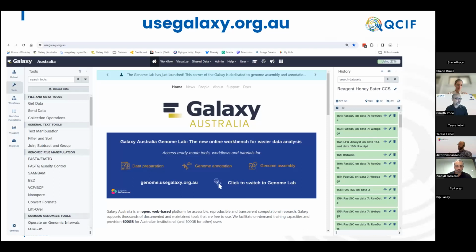Gareth, would you like to give us a bit of an overview about Galaxy? Yes, thanks, Kelly, and thanks, Jeff, for setting the scene. Hello, everyone. I always enjoy the chance to talk about Galaxy.